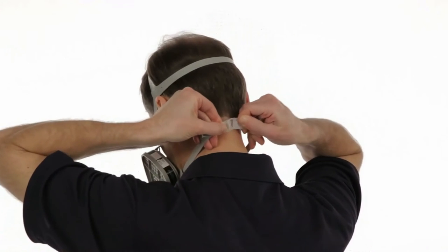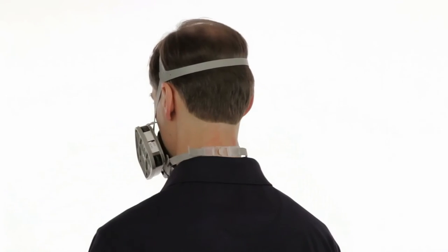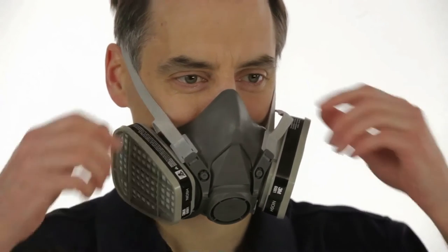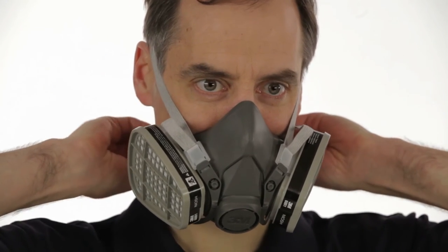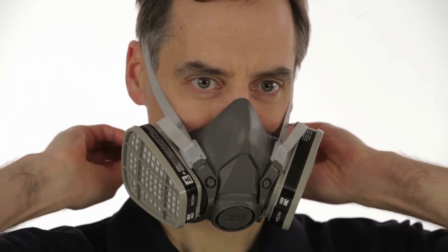Take the bottom straps in both hands and hook them together behind your neck. Tighten the straps by pulling on the ends, top straps first, then the bottom, until the respirator fits securely but comfortably.